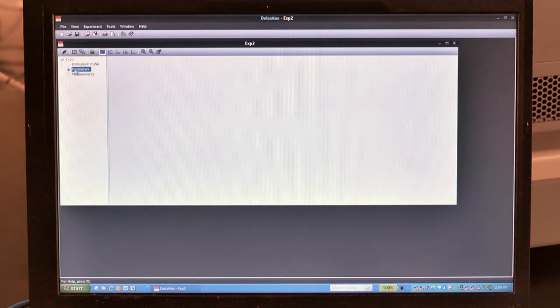We're able to set the initial parameters on the left side here, but we'll run with the defaults for this first run. It's 5 seconds of analysis, 3 times over, 15 seconds total to get the dynamic light scattering and zeta potential. To start the run, all we do is press this green button.